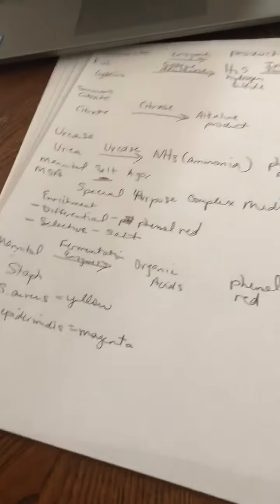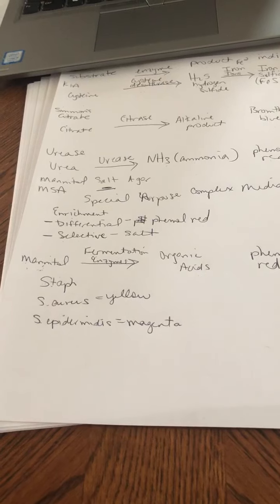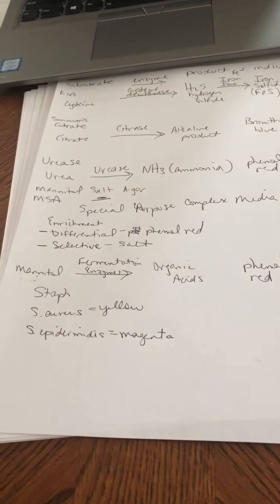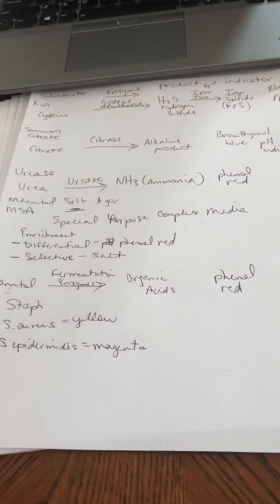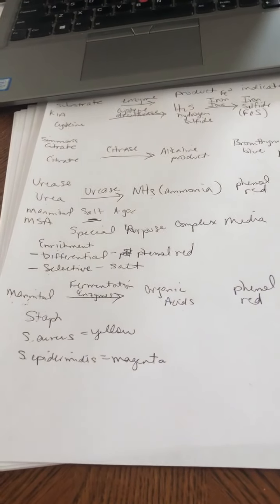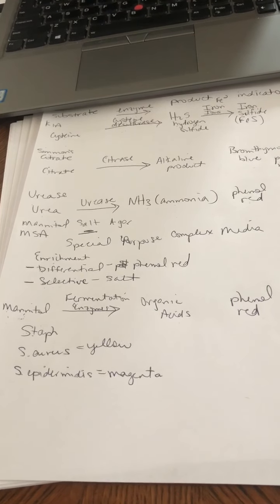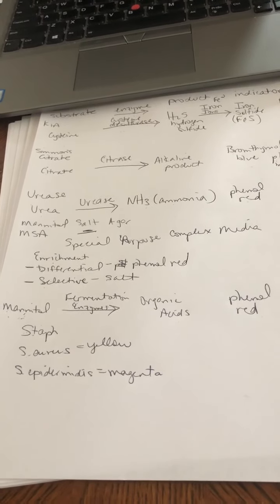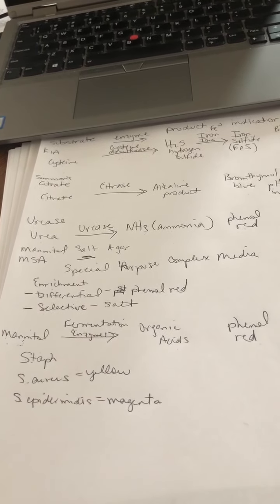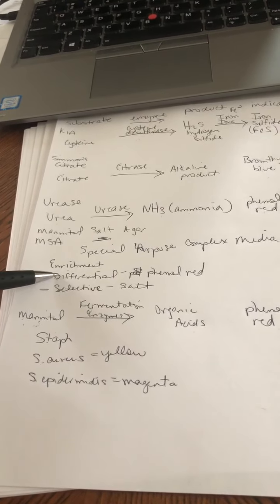That's specifically if we're trying to grow skin bacteria. So if we were in class, we would have made a swab of our skin somewhere, like in our belly button, behind our ear, between our toes, maybe in a place where you have eczema or something. And if it would have grown on the media and turned it yellow, we can make some presumptions that we've picked up staph aureus there. If it would have grown and turned it magenta, we could have made some presumptions that we picked up staph epidermidis there. So if you're wondering about a skin infection, you can use this media to figure that out because it is selective and differential.